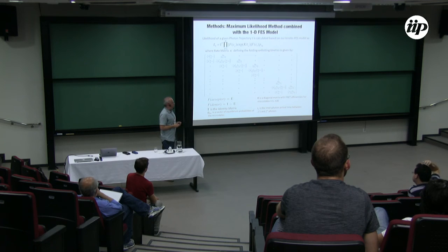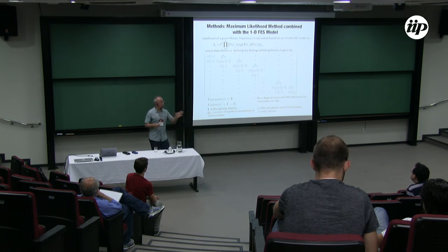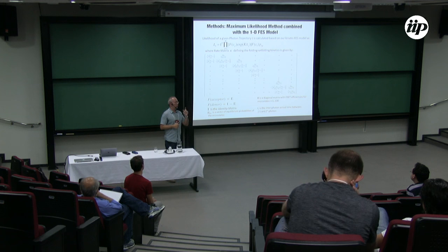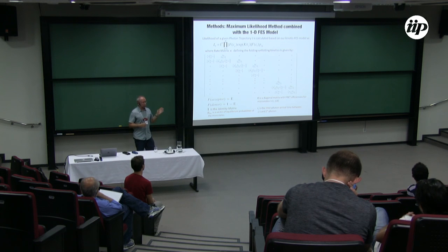Yeah. Question is, I'm not sure how far we should go with this analysis because, when I saw these big biases in the distribution, I said, okay, maybe it's not such a great idea to make a big deal out of these trajectories. But I say it's useful from the point of view that it allows you to see how many photons you actually have in the process, right? How long it takes. I think from that point of view, the analysis is probably fairly accurate. Looking at more complicated things is probably asking too much.